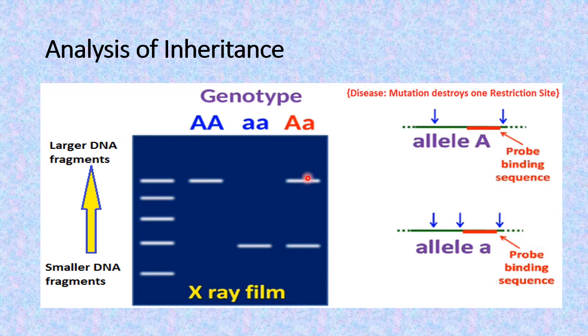So we will know that they are the points of homologous chromosomes, and this is the homozygous chromosome. And when heterozygous alleles are present in the given sample, instead of one, two bands will be obtained on the X-ray film.